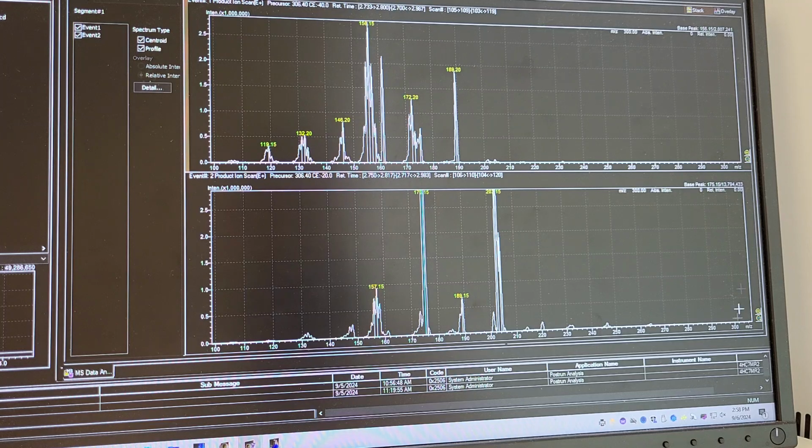So now the scale here on the horizontal axis for both event 1 and event 2 are the same. We can see with a collision energy of 20 versus a collision energy of 40, we get different product ions. As we'd expect, with a higher collision energy, we're going to get smaller fragments, compared to less collision energy, where we might get larger fragments. So now we can decide which fragments we want to look for, and then we'll run the collision energy scan to see at what collision energy we get the highest intensity of the product ions.